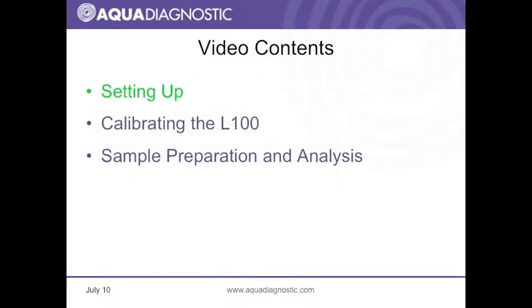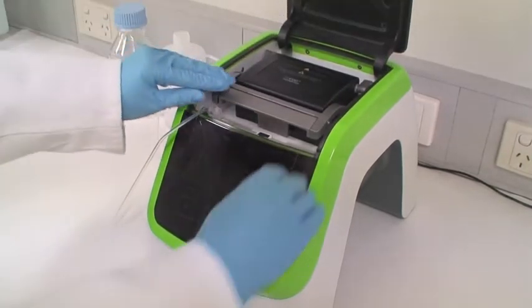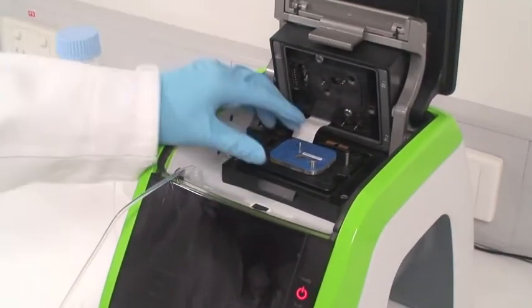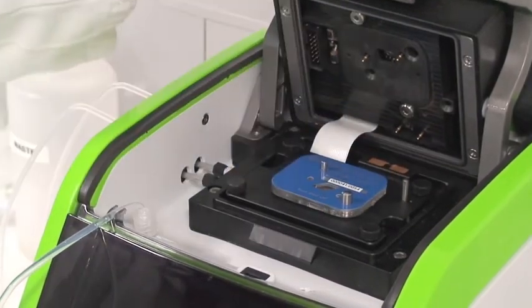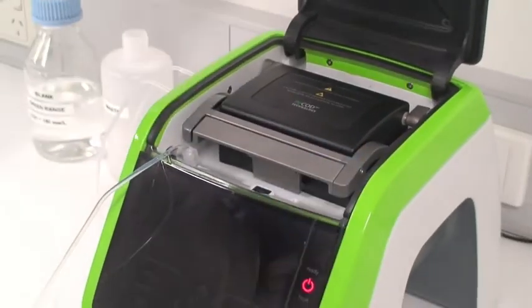Setting up. First, check that a sensor is present. Open the L100 lid and then open the analyzer head. Check that a blue sensor is present as shown. Close the analyzer head and ensure it latches securely in place.